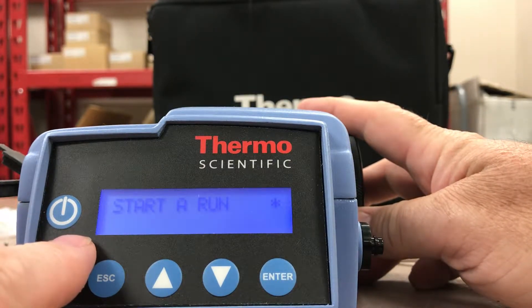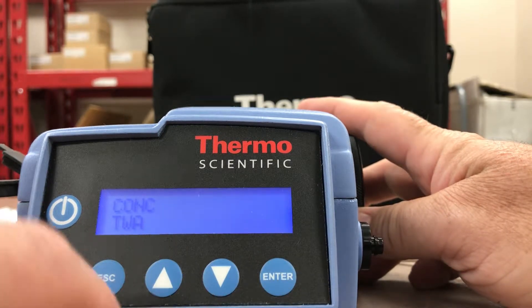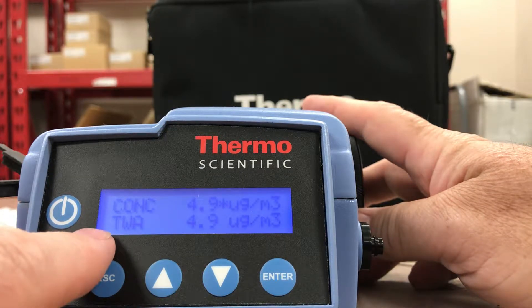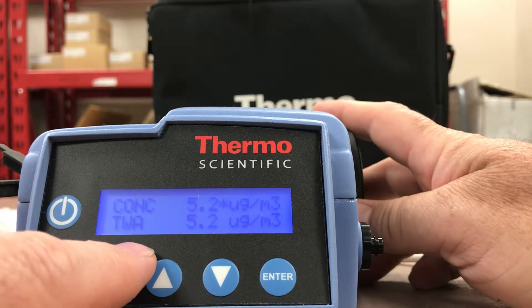The main menu sits at Operate. To start this unit, just simply press Enter — it'll say Start a Run. It shows Concentration and TWA (Time Weighted Average), so it gives you two output readings.